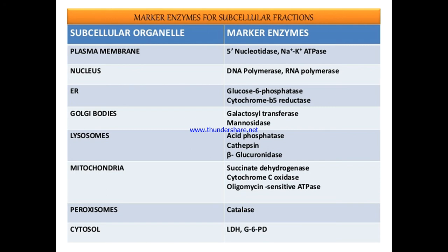Marker enzymes for subcellular fractionation: we have marker enzymes for each cellular organelle. The marker enzymes are cell biomarkers used to characterize a cell type, and they are used in the isolation of the target cellular component. So we have marker enzymes for each cell organelle.